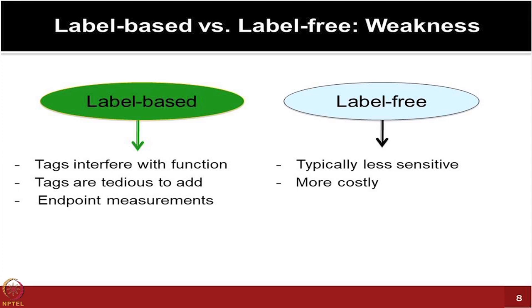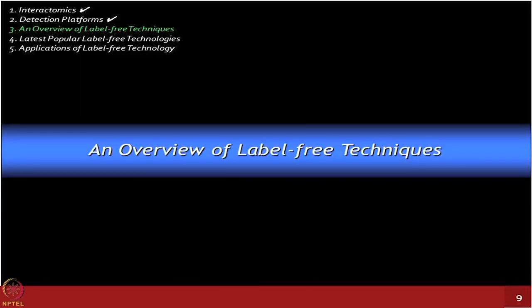So many of the things are still in the early developmental stage, which needs to be tested out well. Just to give you a feel, we are covering two or three label-free technologies in this course, but there are many which are actually under development. And there are a lot of physics people contributing toward making many types of biosensors, involving different physical principles.